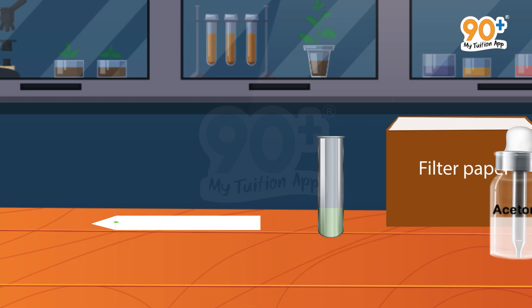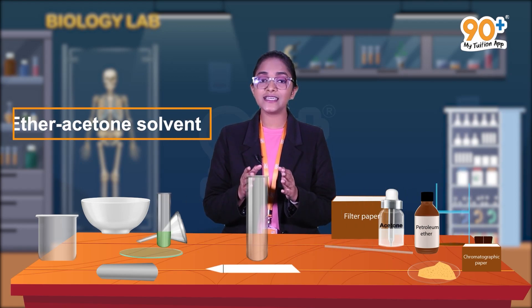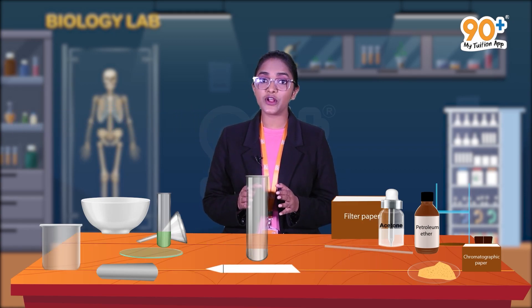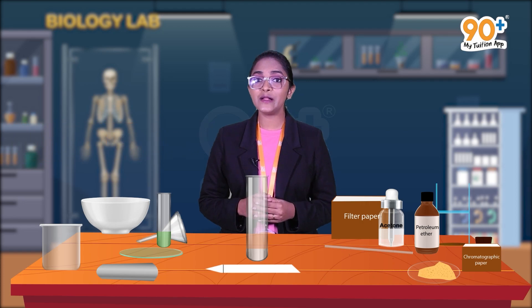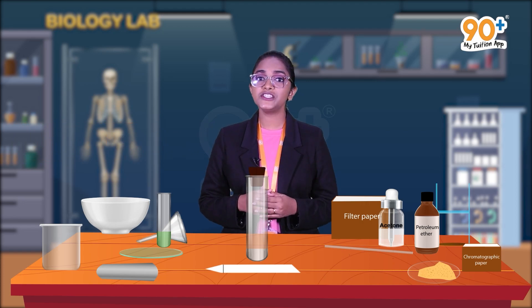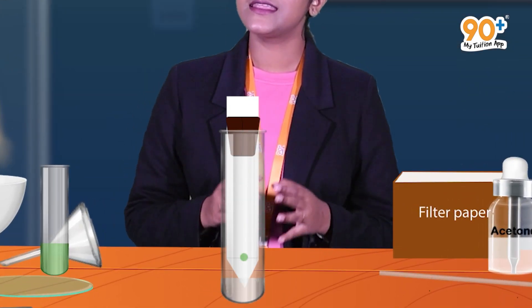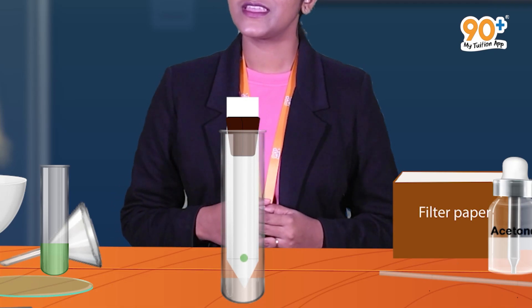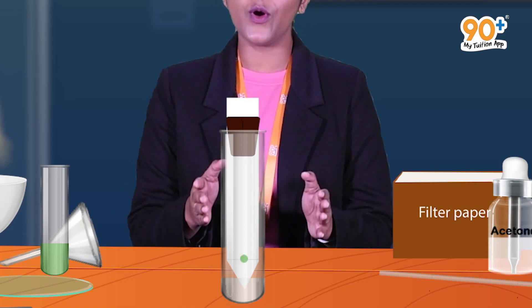One thing that should be noted is that the loading spot should be placed two or three centimeters away from the tip of the notch. Next, add 5 ml ether-acetone solvent into the long test tube. Ether-acetone solvent is the mixture of ether and acetone in the ratio 9:1. With the help of a split cork, hang the chromatographic strip inside the test tube. Keep in mind that the loading point should be one centimeter above the ether-acetone solvent, and make sure the chromatographic paper does not touch the walls of the test tube.